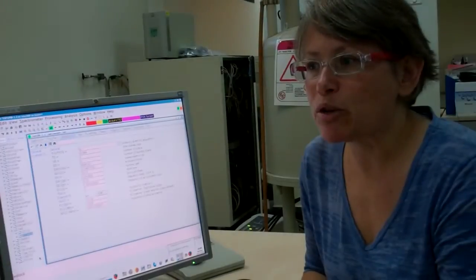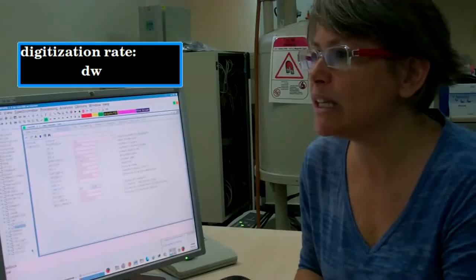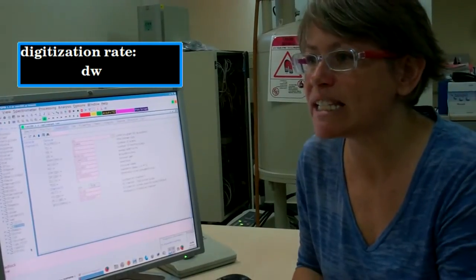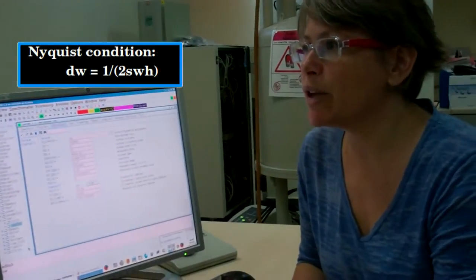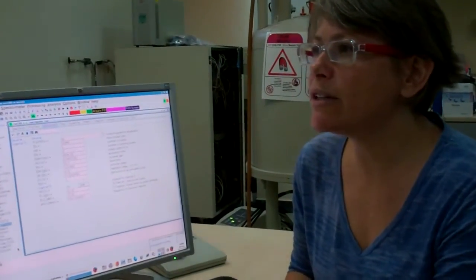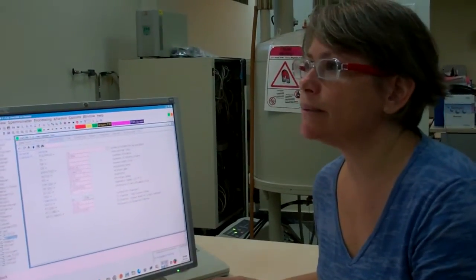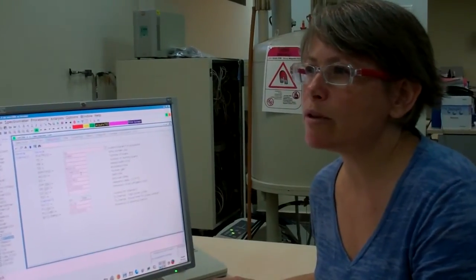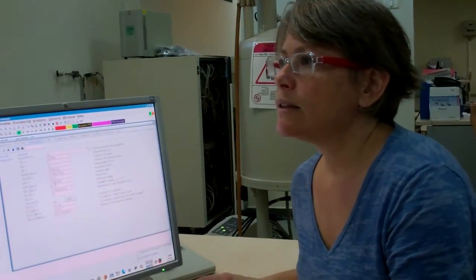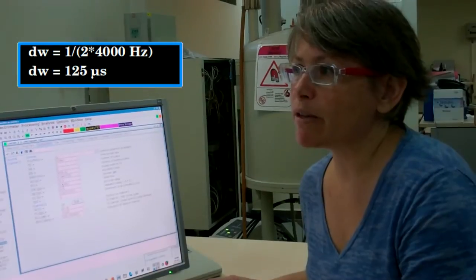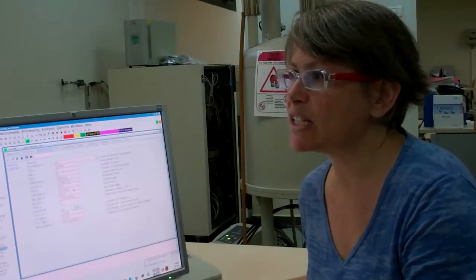When I set the spectral width, I automatically set the digitization rate, since DW, the time between each of the TD points when digitizing the FID, or the sampling rate, or the dwell time, is equal to 1 over twice the spectral width in Hertz. You can try it yourself. The inverse of our spectral width is 1 divided by 4000, and that gives us 0.000250, or 250 microseconds. Half of that is 125 microseconds, which is our dwell. This ensures that the Nyquist condition for digitization is met.